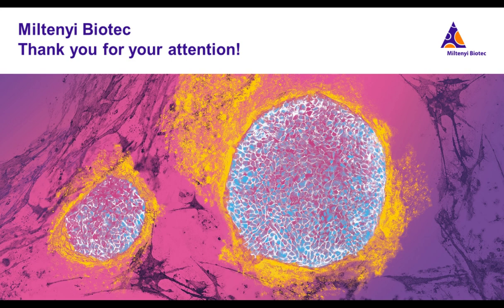So you can also image tissues which are usually suffering from a lot of autofluorescence, for example, liver tissue, because this subtraction offers you still the dynamic range, which is basically the difference between the potential of the camera and the signal intensity of the autofluorescence. And with this, you get very nice results also with tissues having high autofluorescence signals.